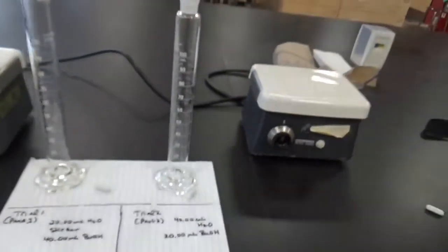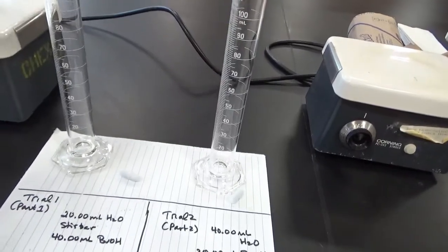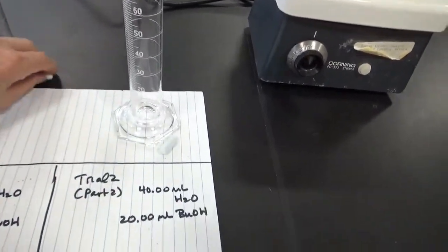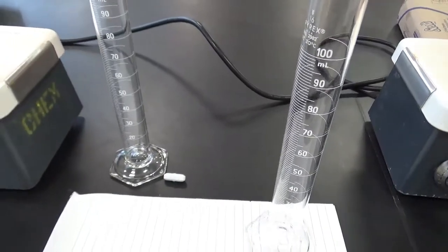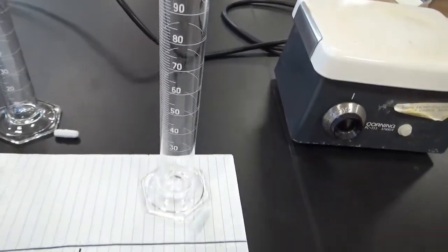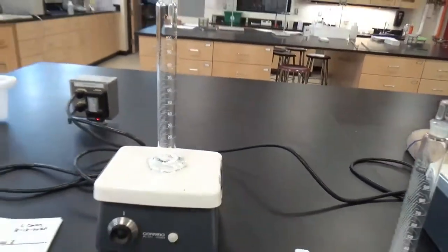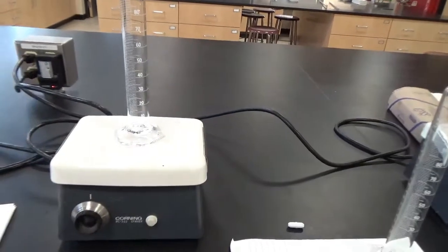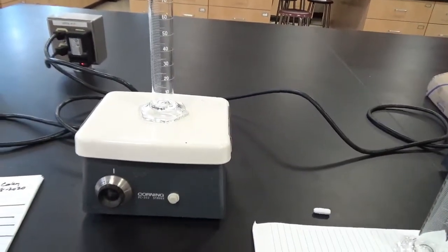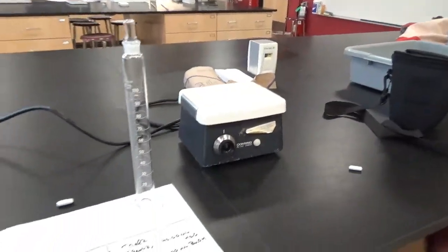I'm going to put the stir bar in each one of these graduated cylinders when I'm finished putting those amounts of the liquids in. I'm going to stopper it and stir it. When it stirs, you should see it very cloudy throughout the entire graduated cylinder, and make sure it gets good and stirred, good and mixed up. And the same thing for the other one.